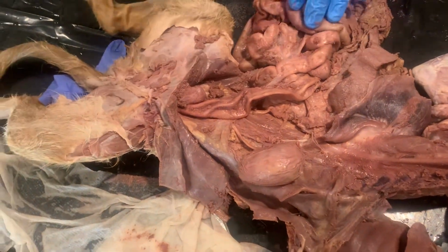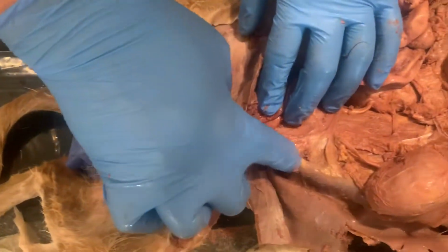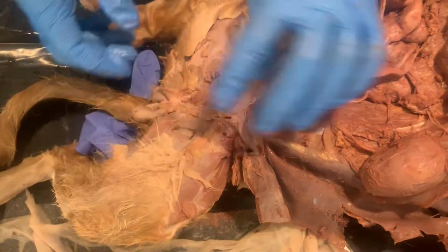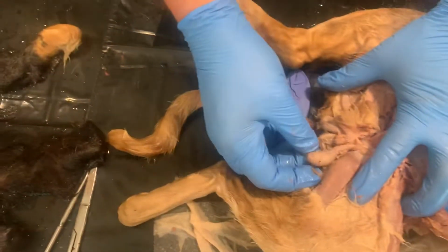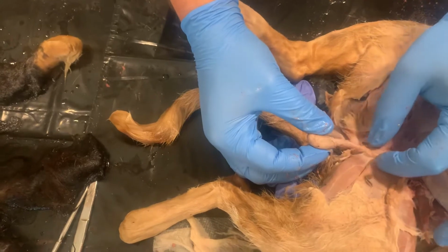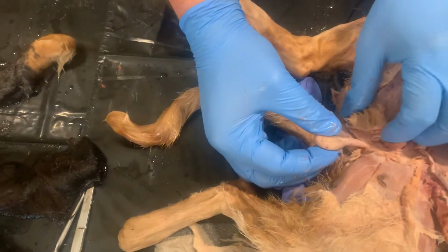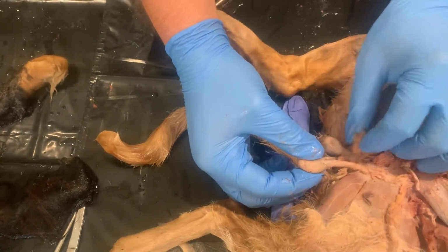much else I wanna talk about. Actually, this cat's a male. So you see there's no fallopian tubes, no uterus because we got a male. So we have the scrotum pulled open here. We have testes. Testes, the vas deferens comes off the testes and up inside the body. And then it's gonna come out of the penis, which is in this right here.